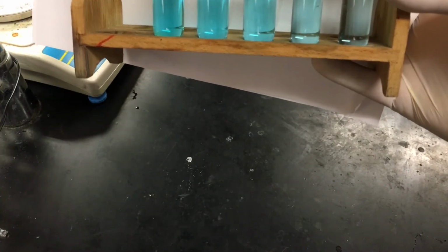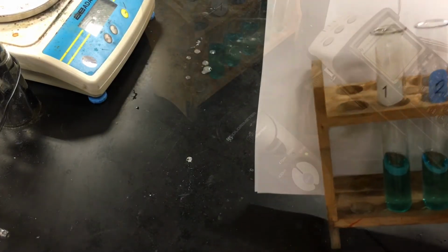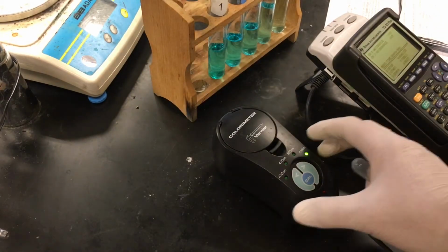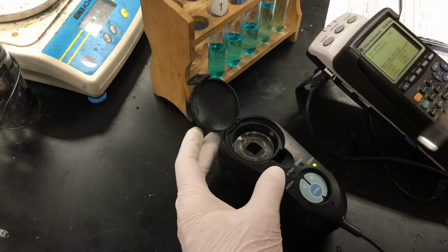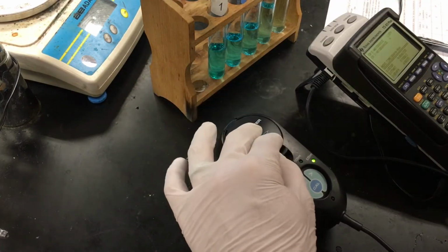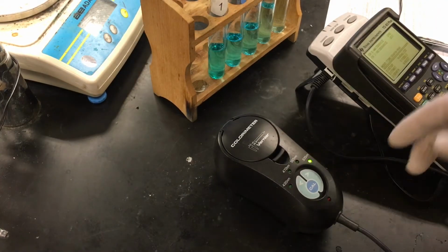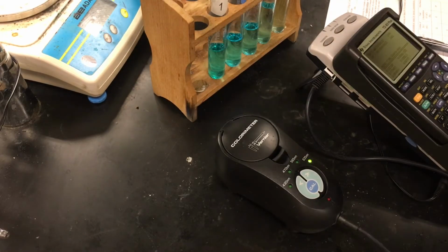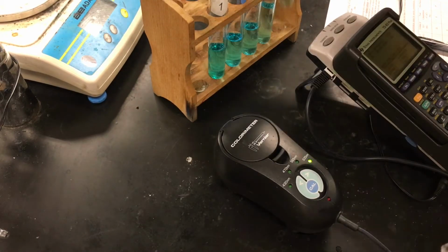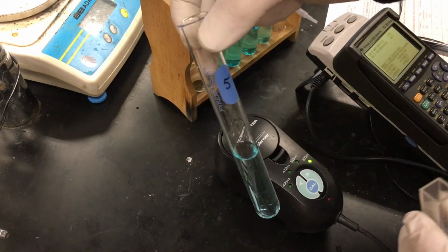And now we have to take the absorbance of each one of these solutions. So after calibrating the colorimeter with a cuvette of water, the colorimeter is set at 635 nanometers, and this is the wavelength of the red color, because the blue solution will absorb the red. We're going to start with our most diluted solution, which is test tube number 5.